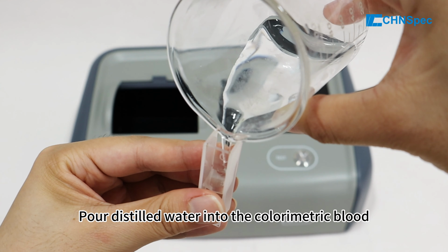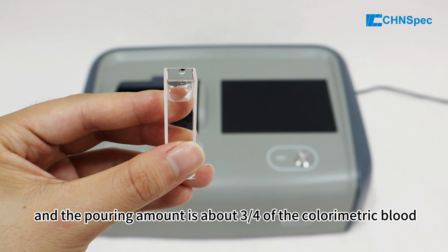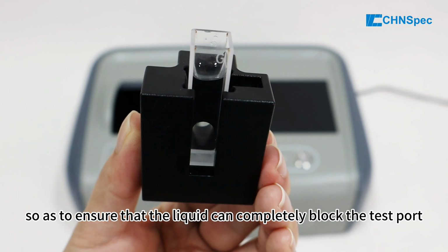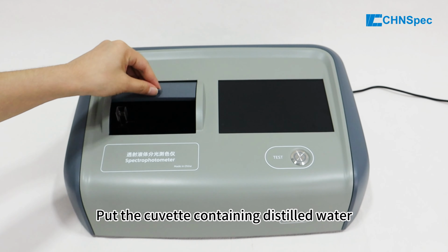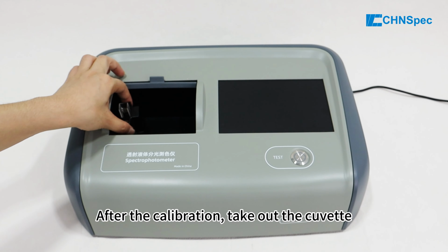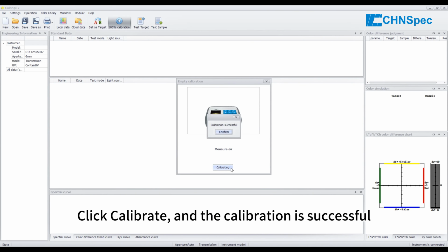Pour distilled water into the cuvette, and the pouring amount is about 3/4 of the cuvette, so as to ensure that the liquid can completely block the test port. Put the cuvette containing distilled water into the machine for calibration and click Calibrate. After the calibration, take out the cuvette and measure the air again for calibration. Click Calibrate, and the calibration is successful.